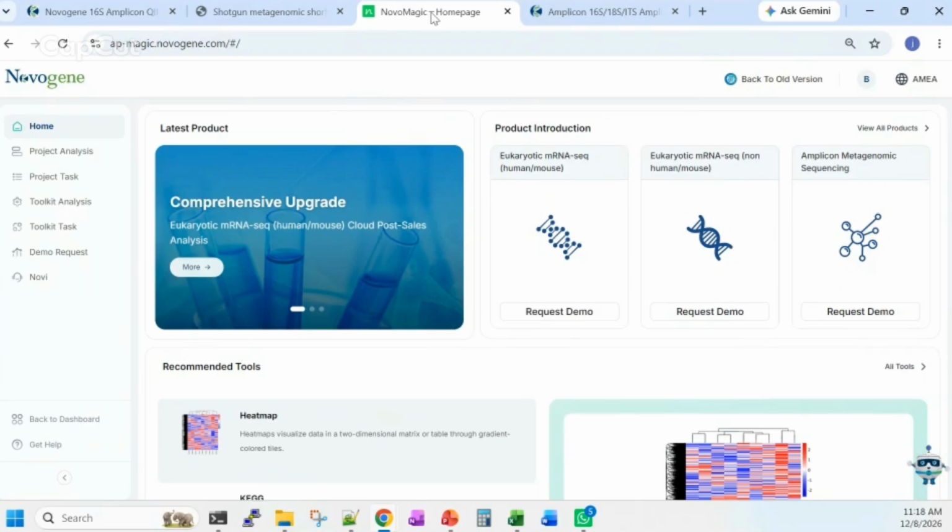So in case you need some further help after you get your data, we are here to help you download the data, to help you go through the results together, and to help identify which files likely contain the data that you want, and so on.